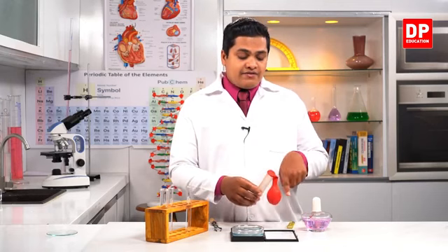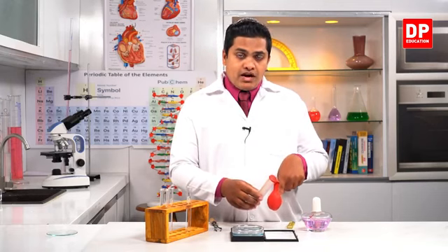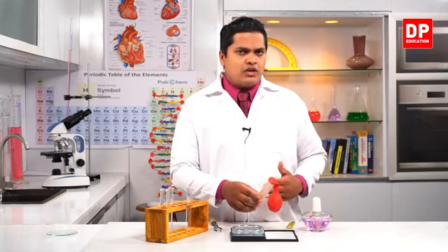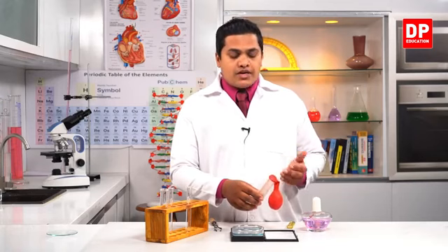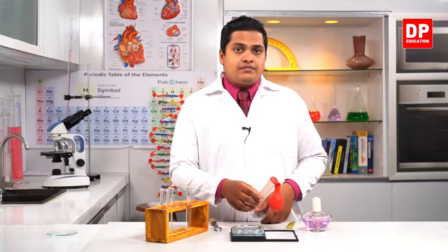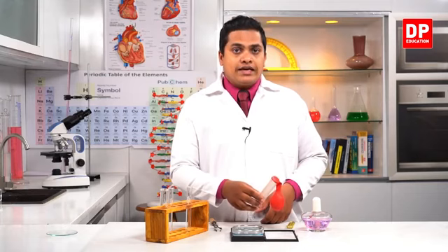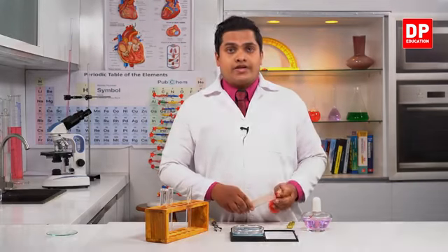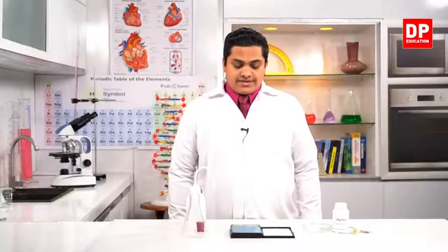Now that gas is being filled into the balloon here. So therefore, there is no loss in the mass, because all the gases which were emitting to the environment, we have now collected into the balloon. So in a closed system, there is no change in the mass, right? So we'll conduct another activity to ensure that our result is correct. Right, my dear children? Now, this is the second activity to see whether there is a change in the mass during a chemical reaction in a closed system.